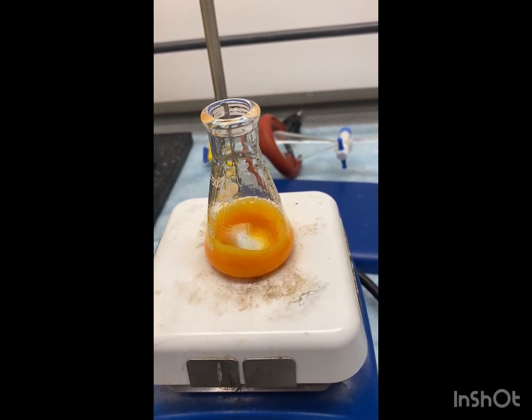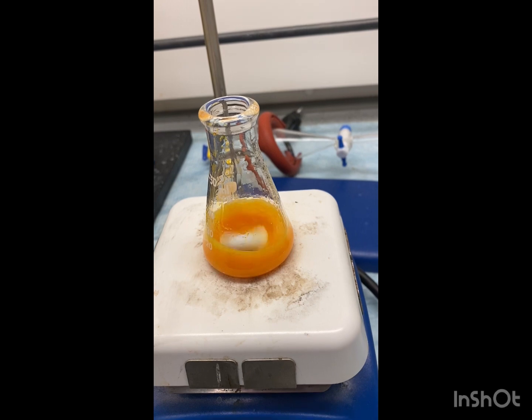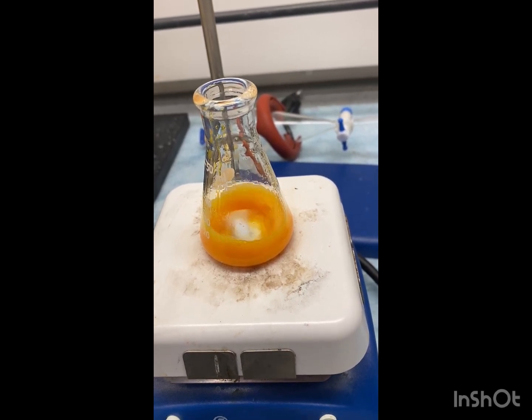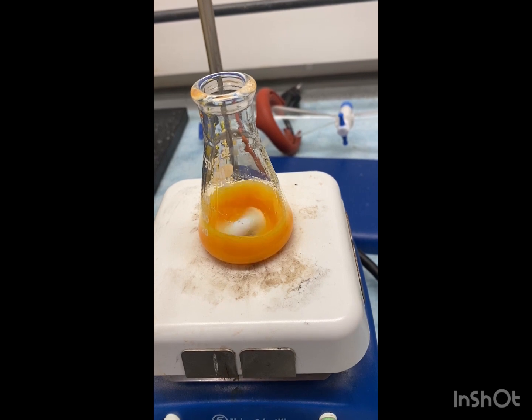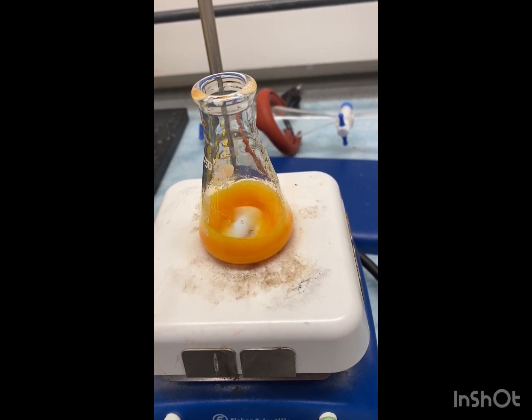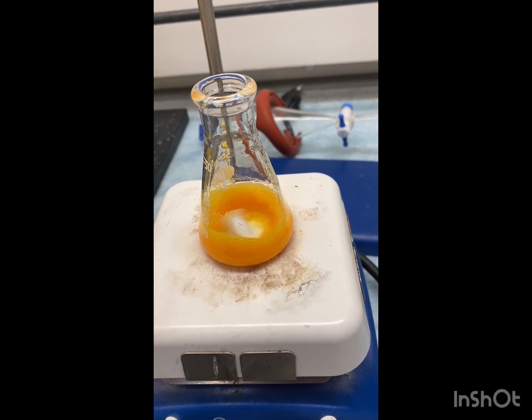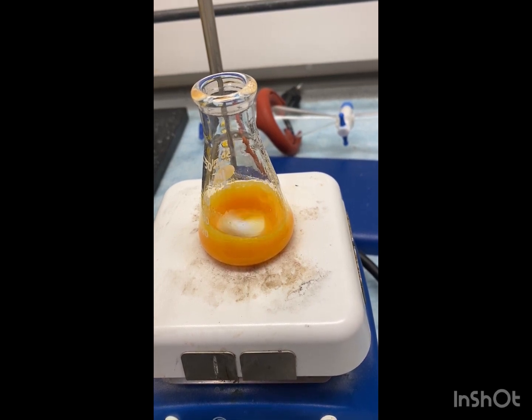All right, we're going to let this continue to heat for around 5 to 10 minutes. While we're letting this heat, we're going to go ahead and get your ice bath ready and get some methanol into your ice bath, so that way it's ice cold when we're going to use it after our vacuum filtration.